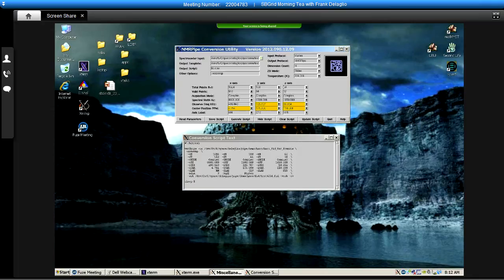However, in many cases, the values recorded in the spectrometer parameter files are not actually accurate representations of what really happened during acquisition. Most commonly, especially on Bruker spectrometers, the temperature value that's recorded in the parameter files may bear no actual resemblance to the actual temperature that was used during measurement of the spectral data.